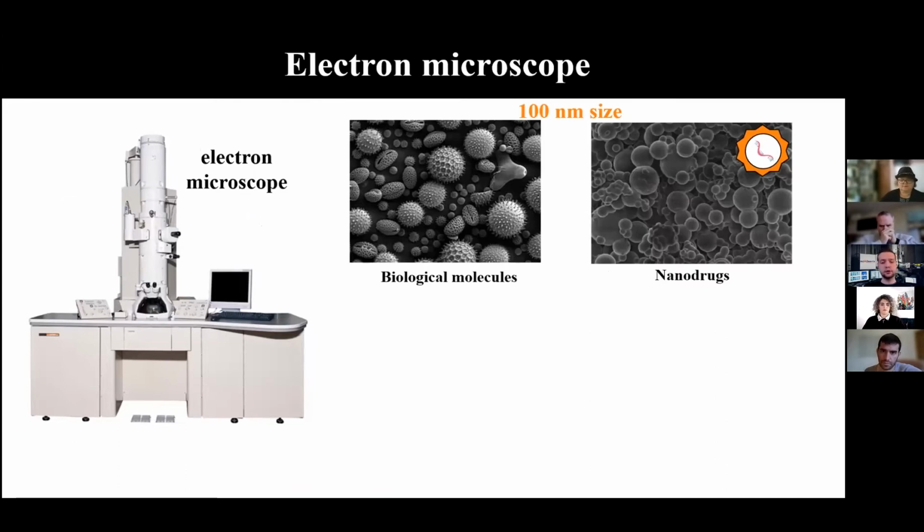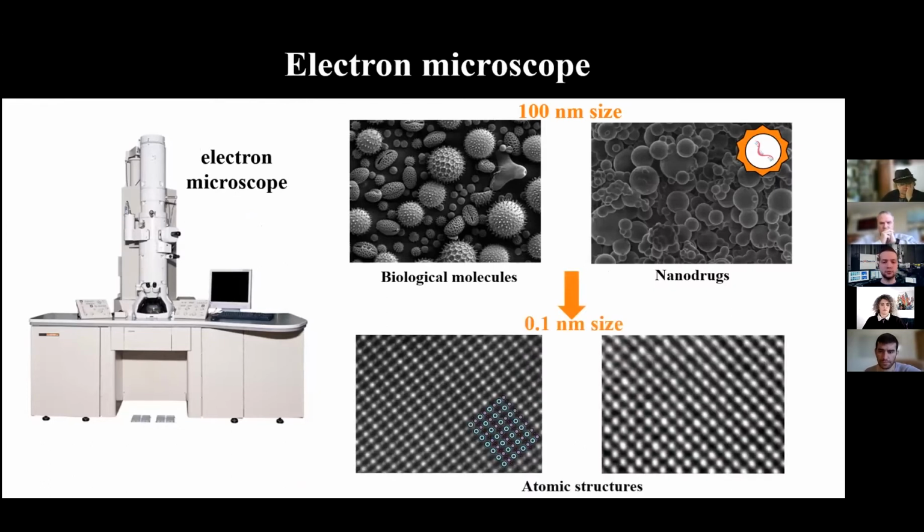With the electron microscope, you can zoom in even more and really see the atoms, the smallest building blocks of matter, whose size is 1,000 times smaller than the nanoparticles used in the vaccine. These unbelievable capabilities of the electron microscope make it possible to image and to study an entire microscopic universe that was before completely hidden from our eyes. Amazingly, all these pictures you can see here are done using an electron microscope.